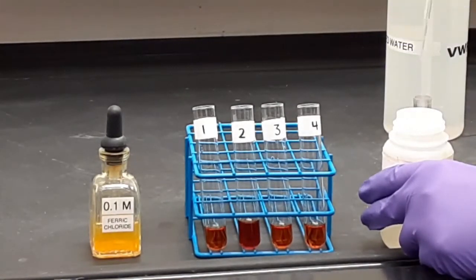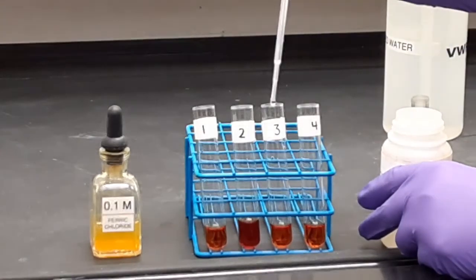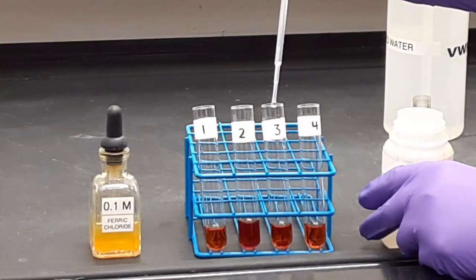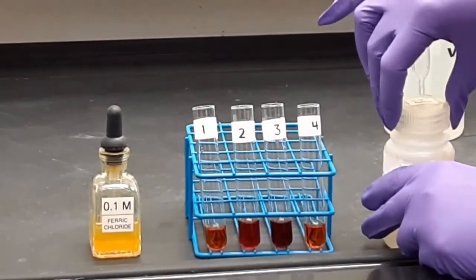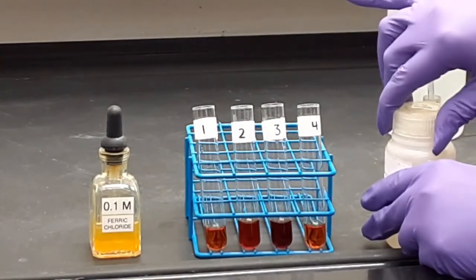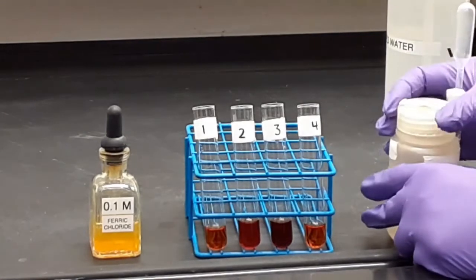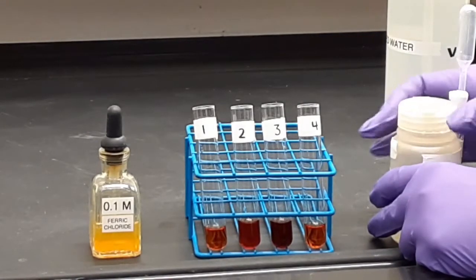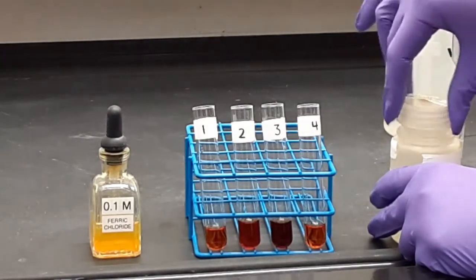And this is the thiocyanate again. And now for something different.